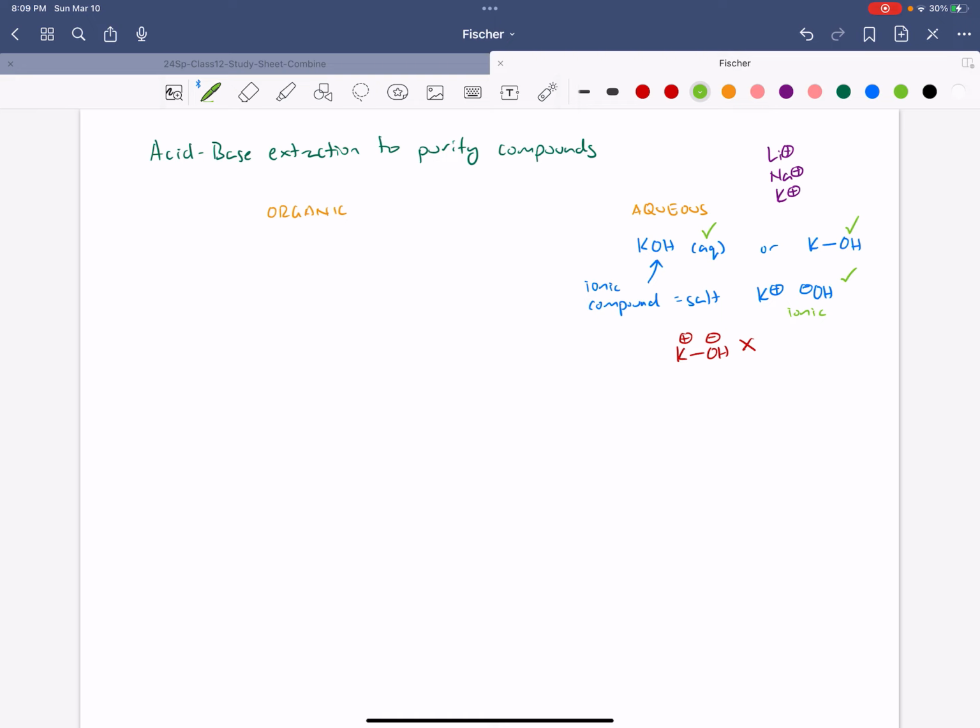In the extraction for your wintergreen oil, we didn't use KOH as the base, right? This is the base, mainly, predominantly that part. We use what I call nachos. And so let's practice. Nachos is this, NaHCO3.